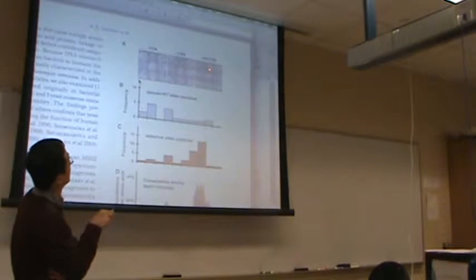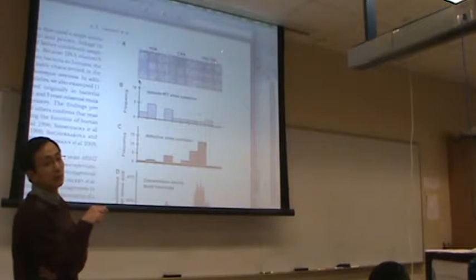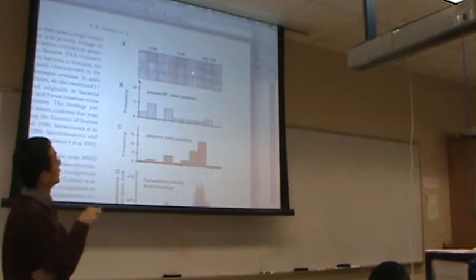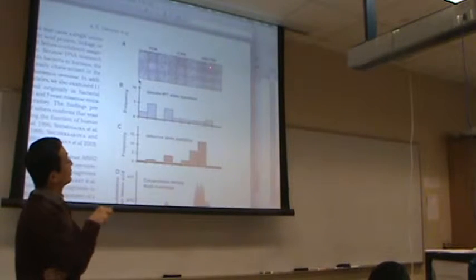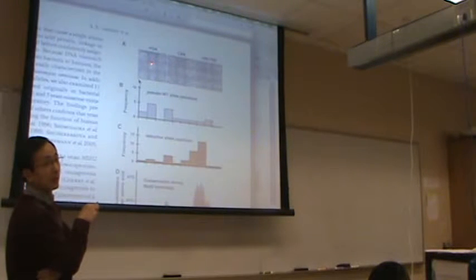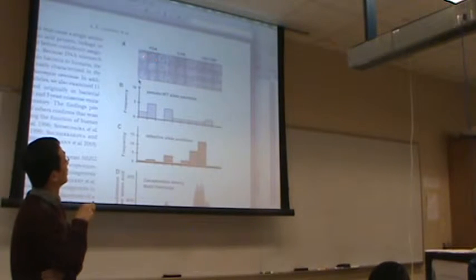Right, so wild type MSH2 should have a perfect mismatch repair mechanism. When the perfect mismatch repair mechanism is there, what is this equation for? How many cells do we see? How many live cells? In the wild type, there's actually nothing growing here.